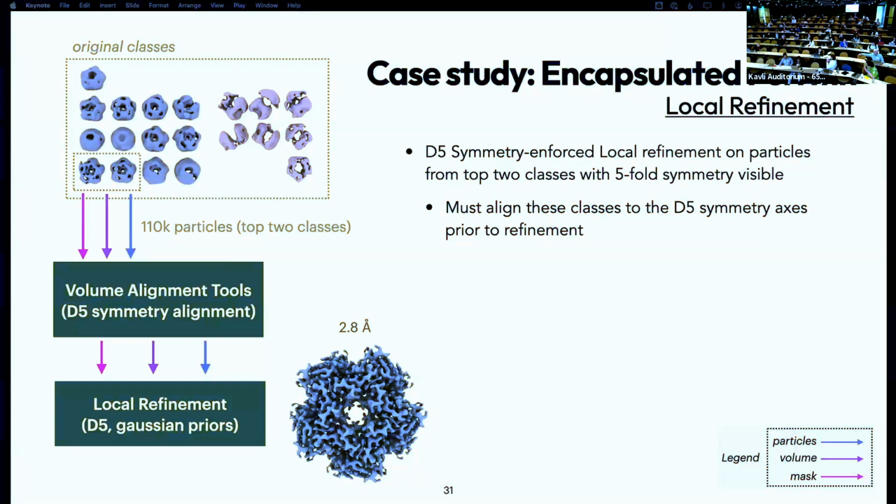It's unclear how much difference it would make on the high resolution end. Like if you're already able to prepare a sample of a target, collect data the standard way and get a high resolution structure, that whole story may not change dramatically with the phase plate. The biggest differences will be in alignability of smaller things. So going down to smaller size scales with cryo-EM, because the phase plate fundamentally changes the CTF and allows us to get low resolution contrast much better than defocus can.